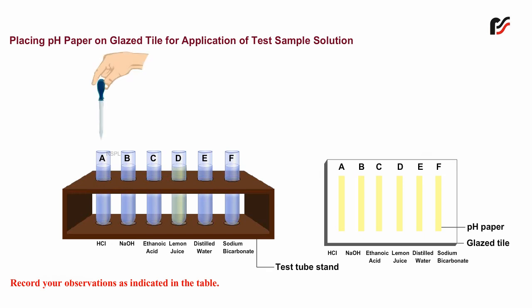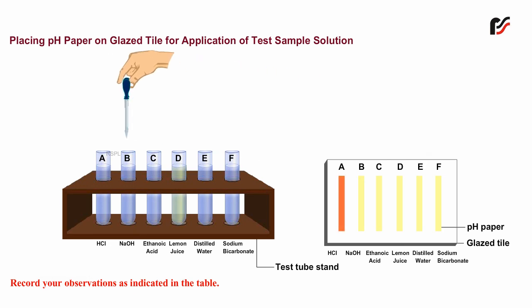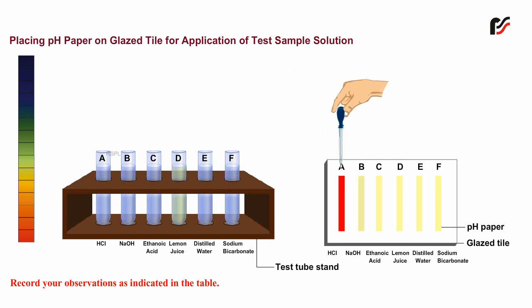On adding a drop of dilute hydrochloric acid, the pH paper turns bright red, giving a pH equal to 1.0 — the solution is acidic in nature. On adding a drop of dilute sodium hydroxide, the pH paper turns bluish violet, giving a pH equal to 14.0 — the solution is basic in nature.